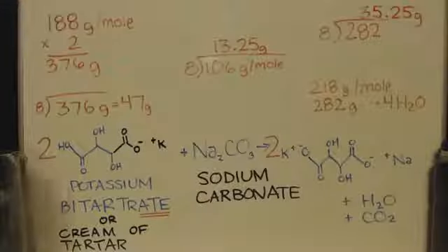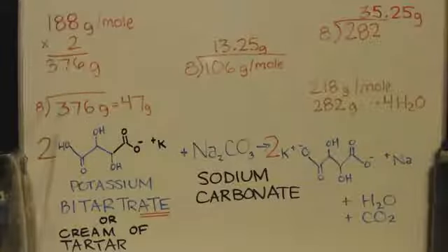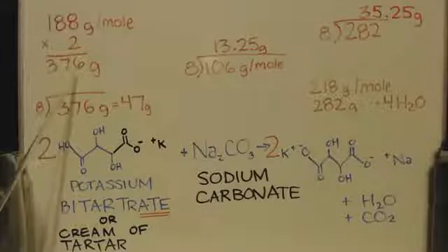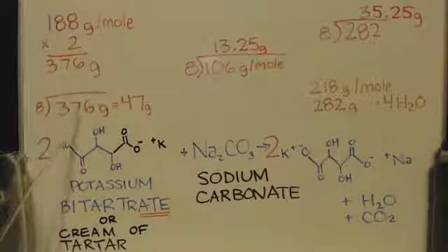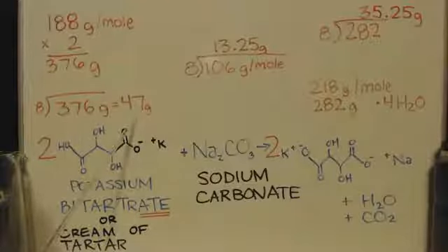How did I figure out my stoichiometry? Here's the formula. It's two of these. One of these makes two of our product, right? This is cream of tartar, sodium carbonate. Here's the molar mass of this. Now we need two of it, right? So I multiplied it by 2. Now I'm only going to use an eighth. I'm multiplying everything by an eighth. So I divide by 8, and I get 47 grams. That's how much I used in the experiment.